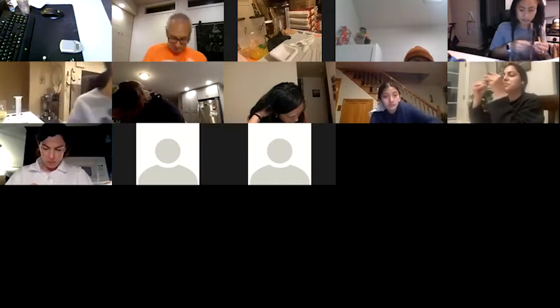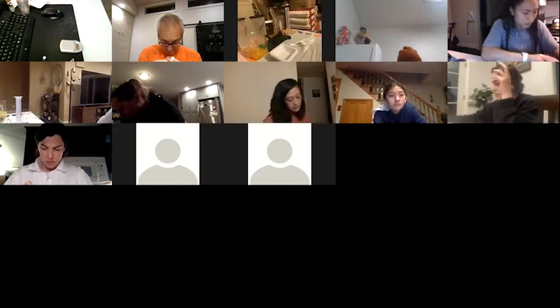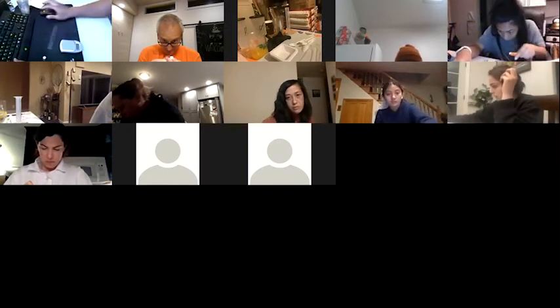Oh, here it is. Yeah, I'm already seeing some little variation in between each one.